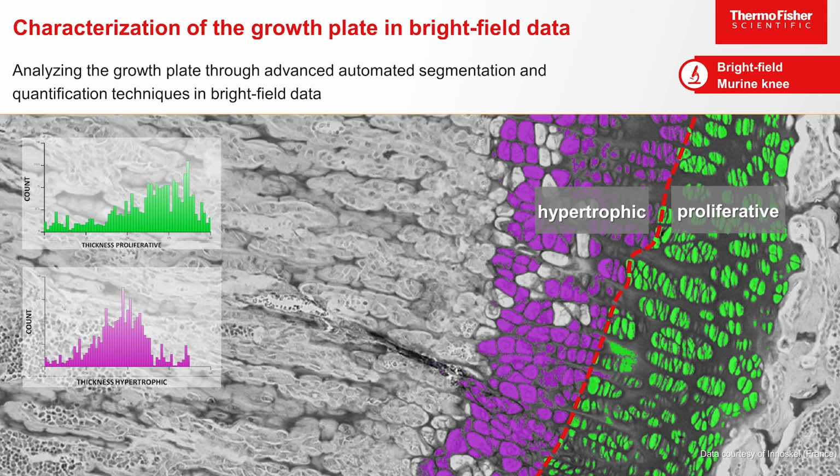In the following demonstration, you will see how to perform a reliable automatic separation and quantitative characterization of those two different segments. For this automated workflow, pre-processing and segmentation steps will be used.